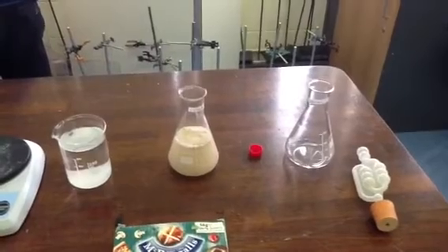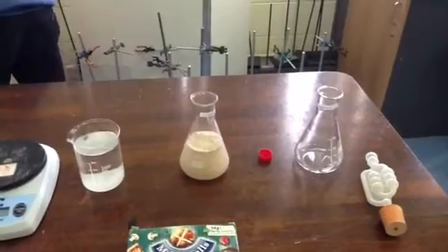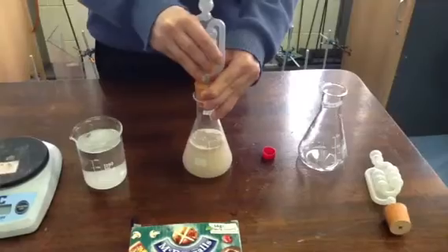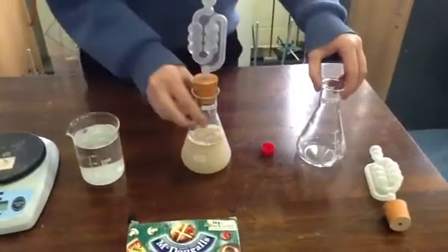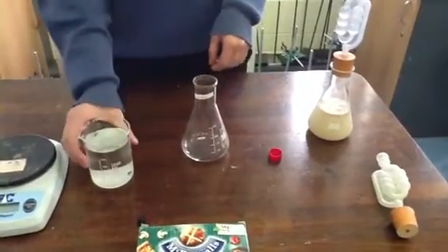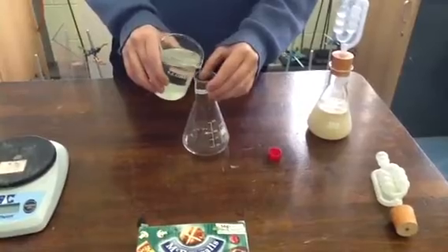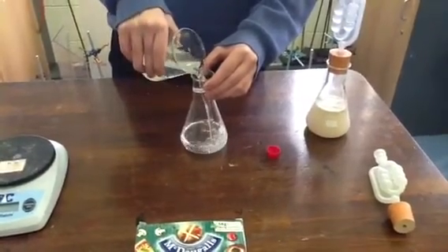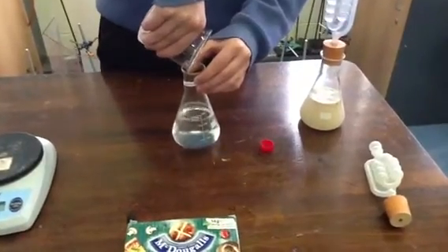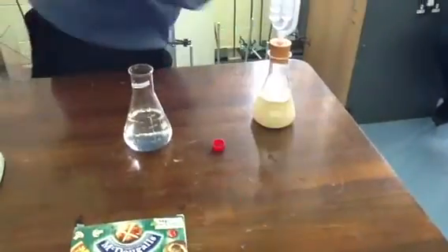Benedict is just half-filling the fermentation lock with water so that we will have anaerobic conditions. Now we have to set up our control as well. Benedict, what are you going to add into the control? Glucose solution, with no yeast. So this one is just the sugar solution and no yeast, but everything else has to be kept identical. We also have to half-fill our second fermentation lock with water.